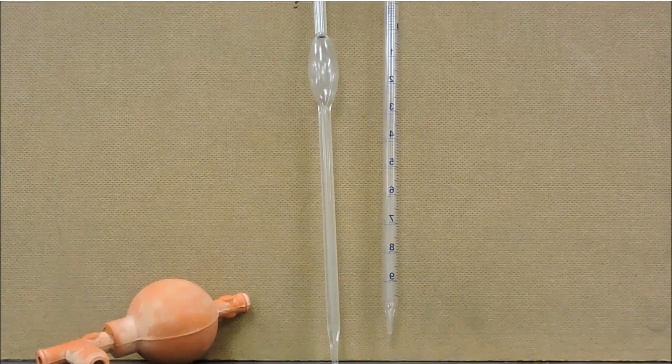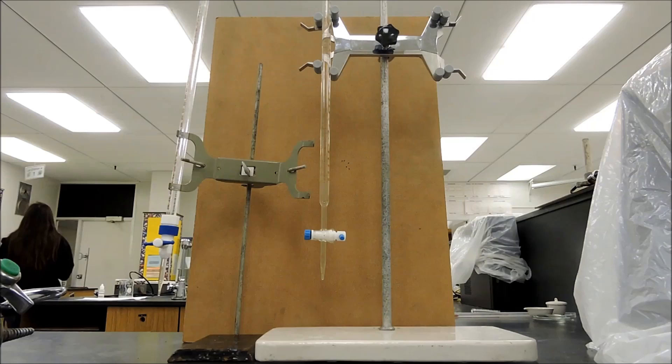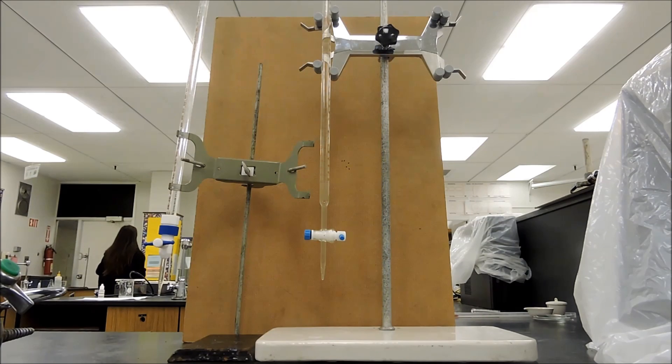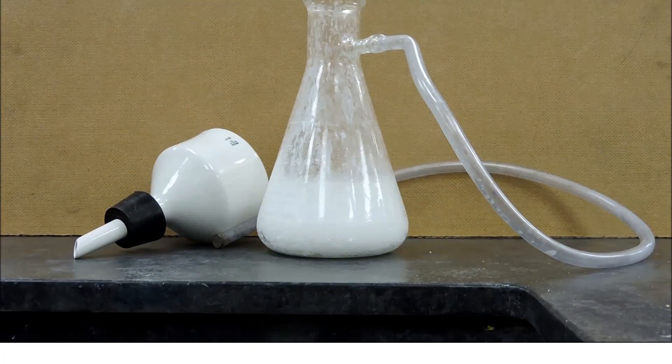These are burette clamps which hold up burettes. Burettes are the most accurate when it comes to measuring volume. You'll most likely use these in titration labs. The item to the right is the filter flask and the item to the left is the Buchner funnel.